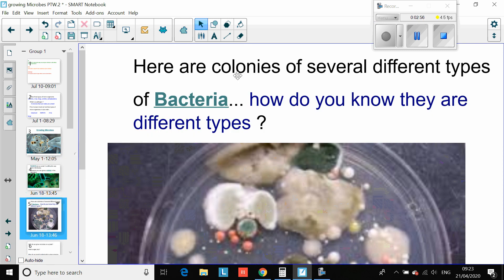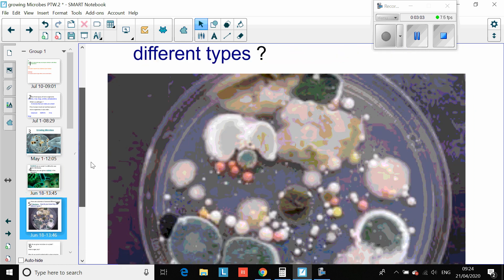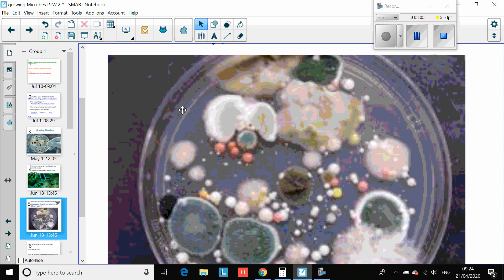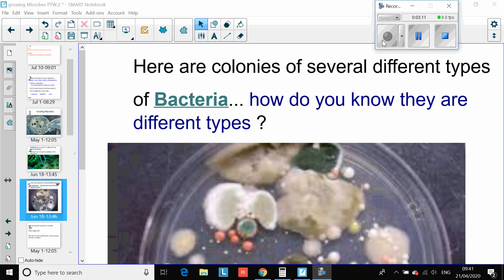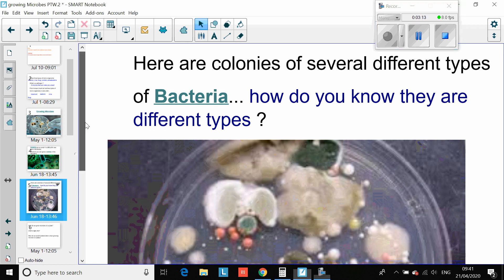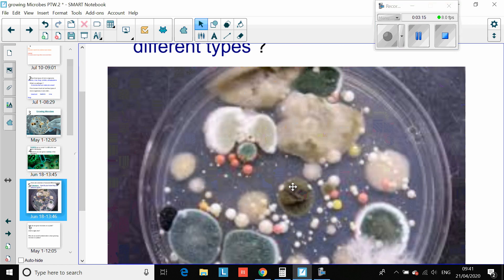Here are several colonies of different types of bacteria. Pause the video and bullet point how we know they are different. The way we know there are several different types of bacteria: they are different colours — brown, yellow, grey — different textures as well, some with fuzzy edges and white. There are also different sized colonies; some are quite small, others are rather large.